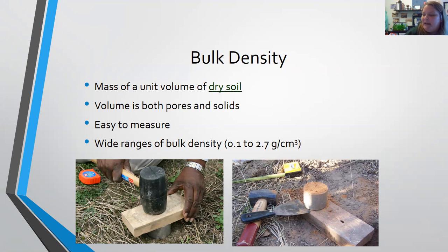And then most times pulling it up, there's not too much issue with the soil falling out, unless it's super, super sandy. Then you might have issues with lifting that core out and it still just falls through. In that particular case, it might require a few more steps, but just think about pounding this core into the ground, being able to pull it right back up, and that soil in the core hasn't been compacted any more than what it already was by this method, so it's very representative of what's occurring in the field.